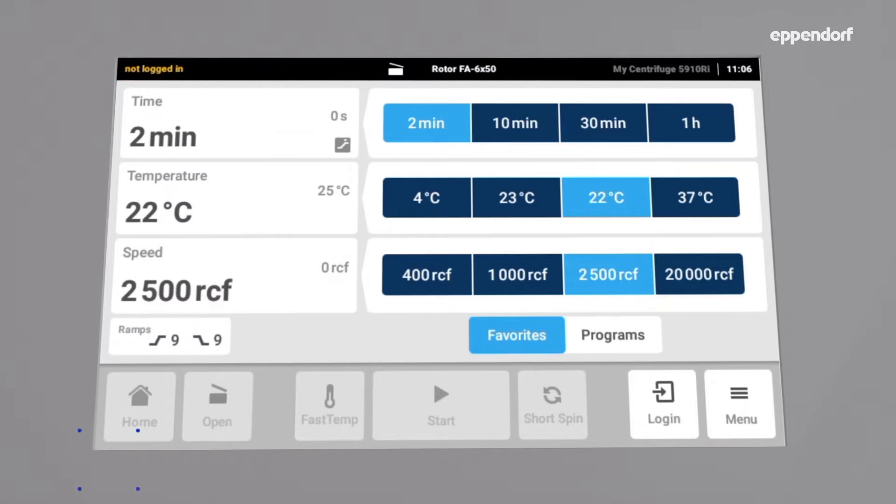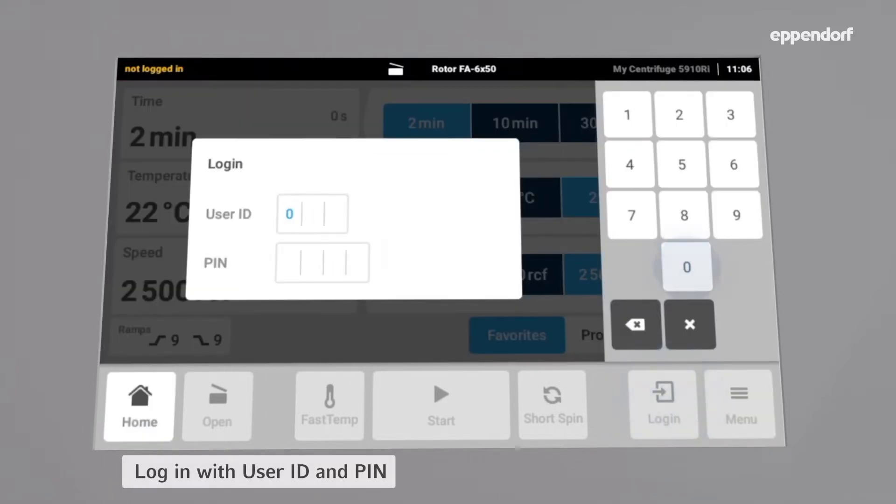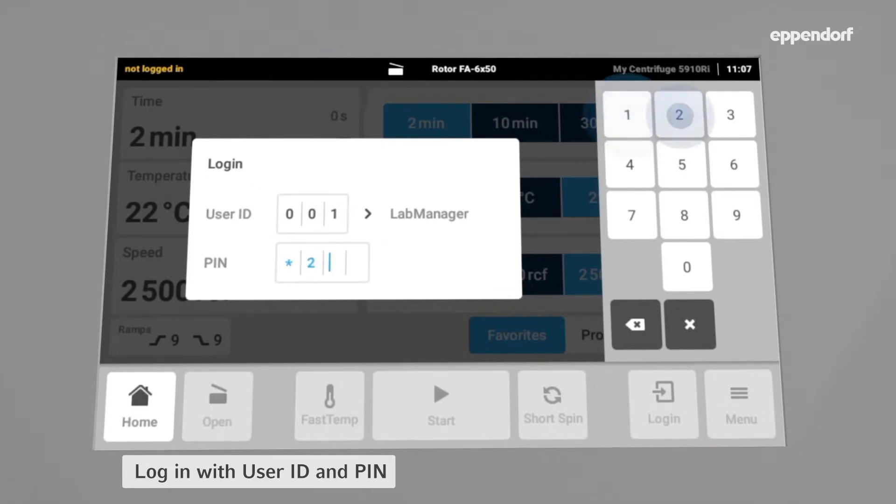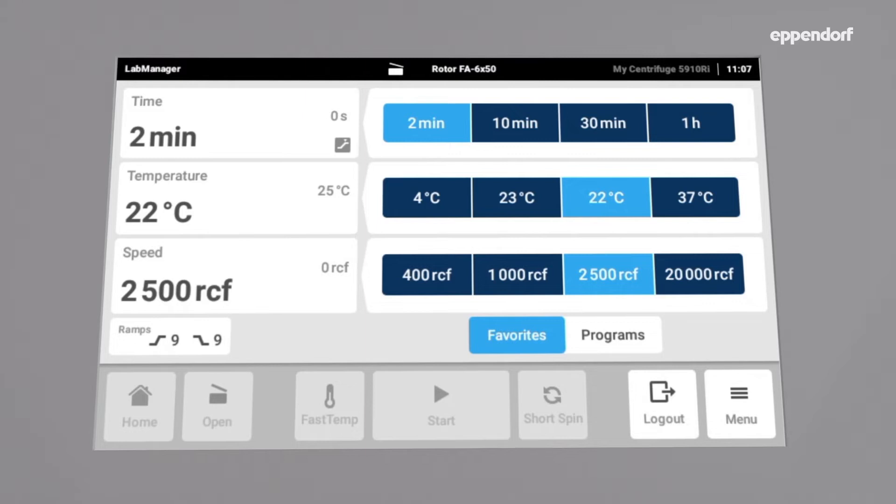To log in, tap Login and enter your personal three-digit user ID, followed by your PIN or password, depending on which setting you have chosen during the user management setup, and you are all set.